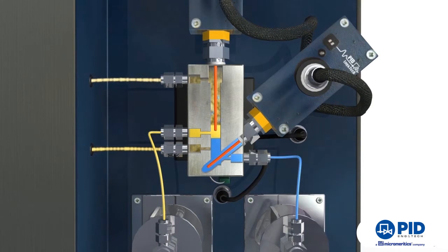The vessel has one inlet for the reaction product and three outlets: one for the gas at the top and two for the liquids, water at the bottom and hydrocarbons above the water.